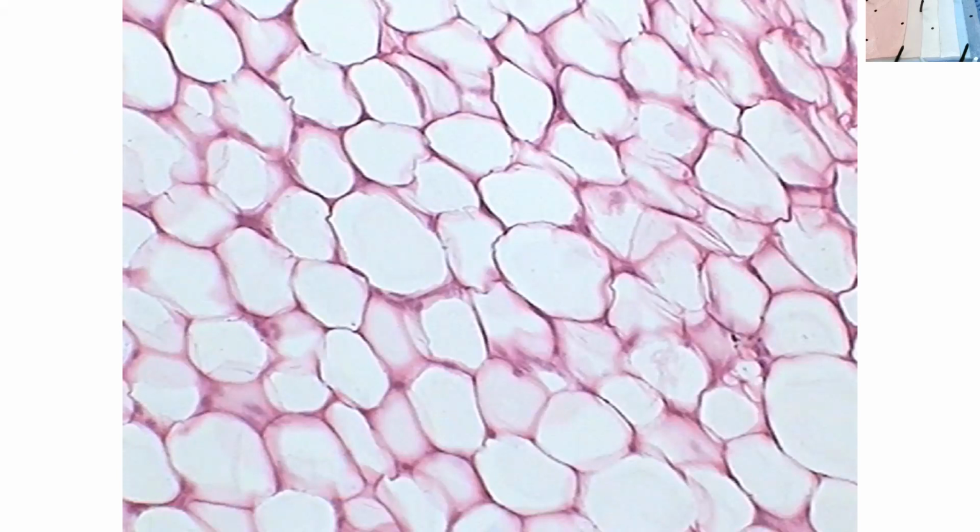And we have living cells. If you look carefully, you can see there's a nucleus right there. These cells will expand and contract as needed. The fat will be converted to glucose.